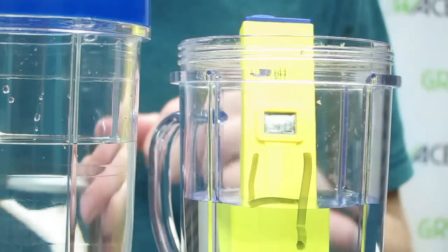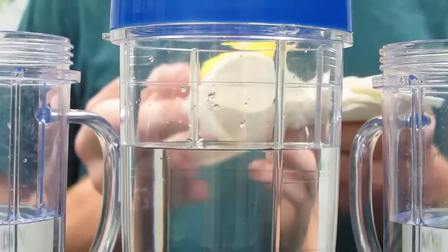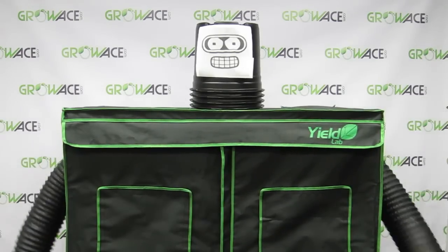Once you adjust it with the screwdriver, rinse it one more time and dab it dry with a napkin. Calibration is complete.